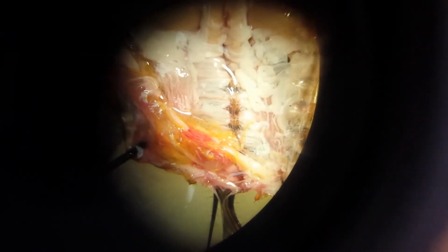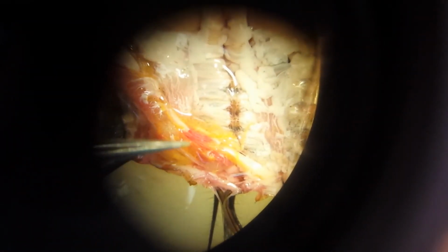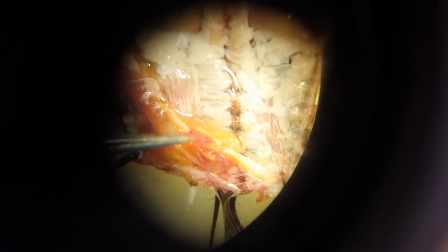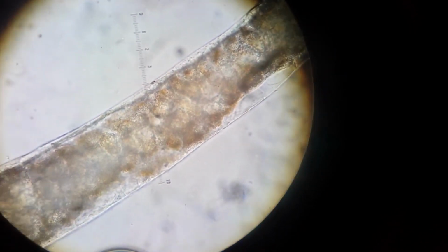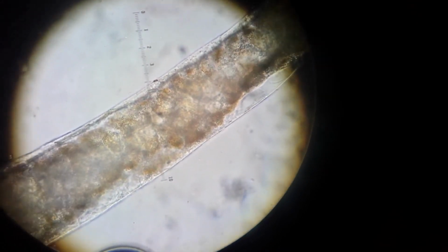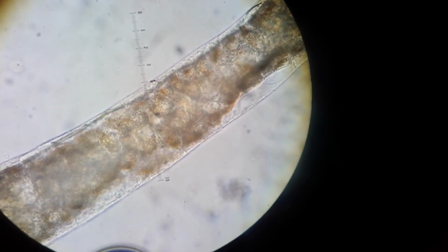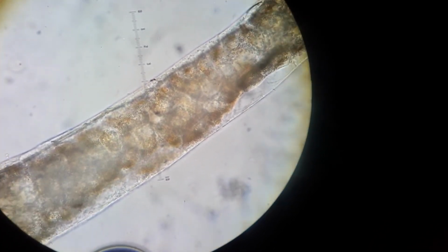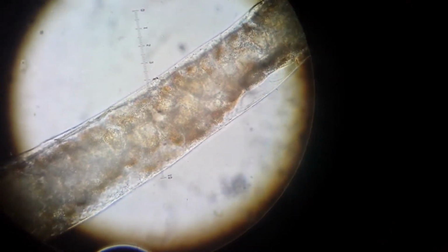Alright, so here's an even closer up view of the Malpighian tubules. So all this yellowish stuff here around the hindgut are the Malpighian tubules. They're kind of like spaghetti. And last but not least, here is a 100x magnification of the side of this Malpighian tubule. In this case, I didn't let this cricket sit for very long with amaranth, so we don't really see much amaranth in association with this particular tubule. So let's take a look at another one and see if it looks any different.